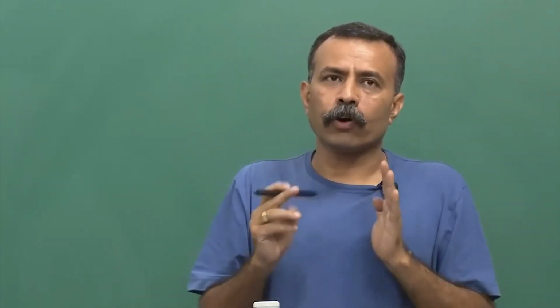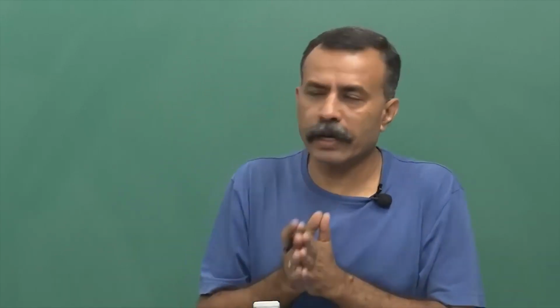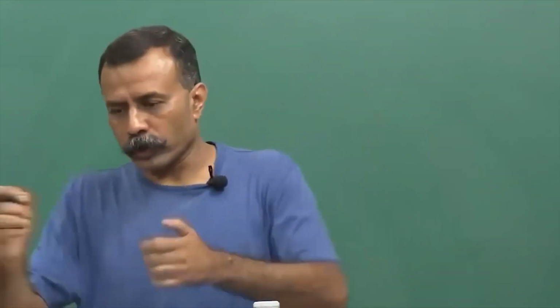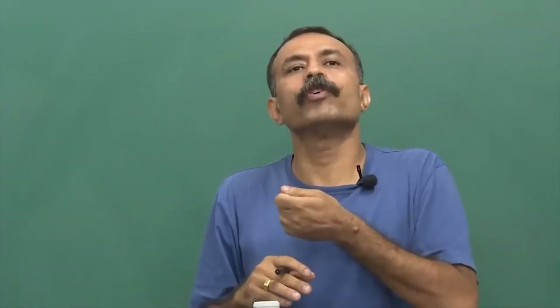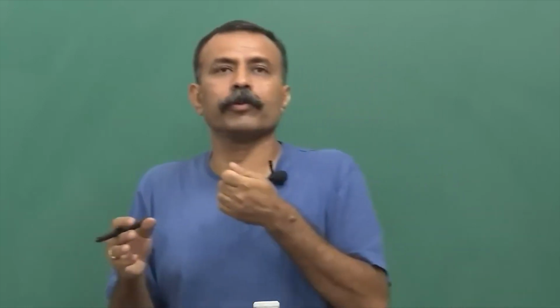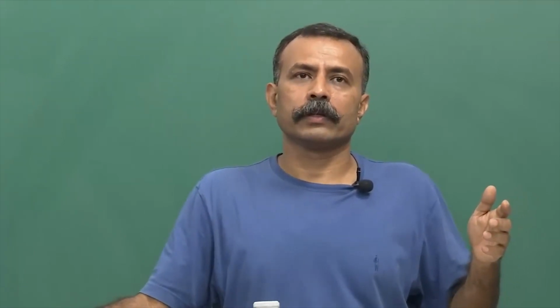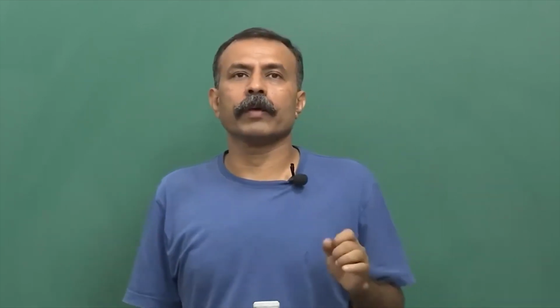As long as you are following these very basic fundamental rules, and when you are inside the lab, be dedicated for that period of time. Do not keep doing this, I'm talking, I'm doing, because whenever you have to talk, you have to remove your mask. I have nothing against talking, but when you remove your mask, you spread several things all over the place. This especially holds true when you are working on the laminar flow hood.